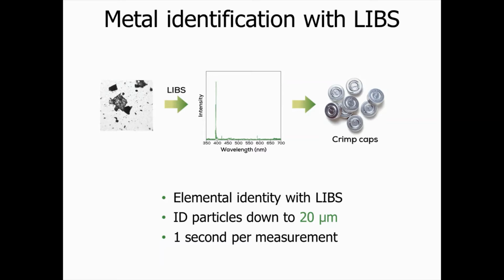Like Raman spectroscopy, LIBS identifies the particle material by matching unknown spectra to built-in or custom-added spectra in a reference database. It is a great addition to Raman spectroscopy, which is not sensitive in picking up glass or metal signals, while these materials typically provide a great and very material-specific signal when doing LIBS. The other great thing about LIBS is that it only needs 1 second to identify a particle.